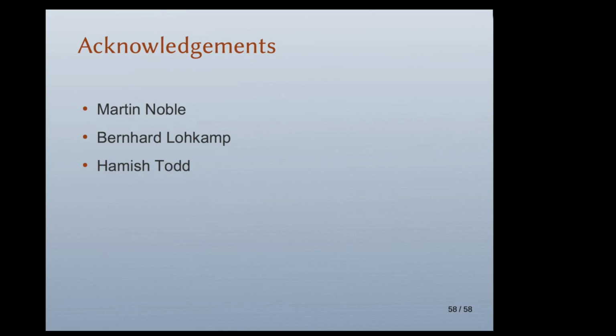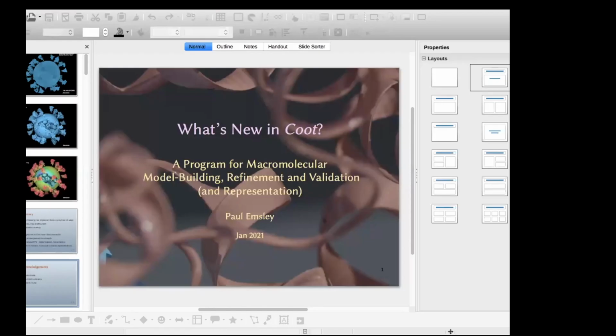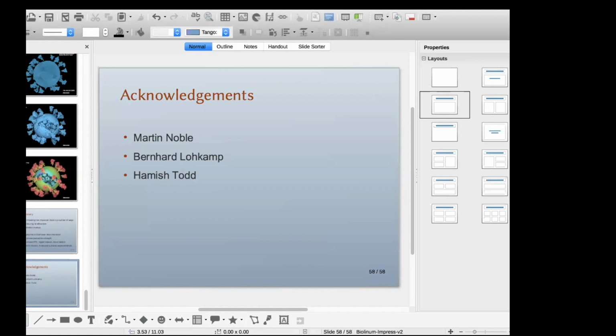I'll just finish there. Great, thank you very much. If you have questions, you can send them by chat. I believe you can also raise your hand and we can unmute you, and people can ask questions directly. I'll kick off with a few from chat. If you've got some, raise your hand or send us a chat, and we can unmute you if you like.